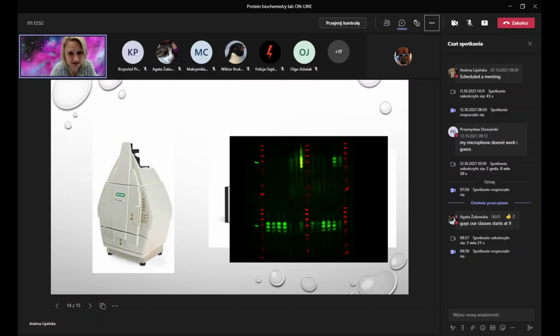With chemiluminescence, there are different substrates that we can use, which differ in the concentration of luminol and its stability. As a result, they differ in their sensitivity, so how much of a protein they can detect. And now it all depends on what you expect.